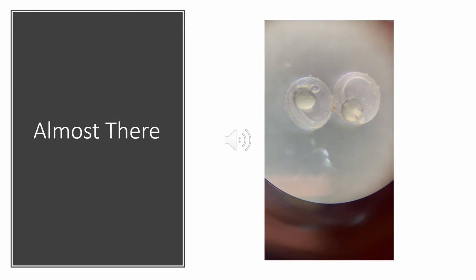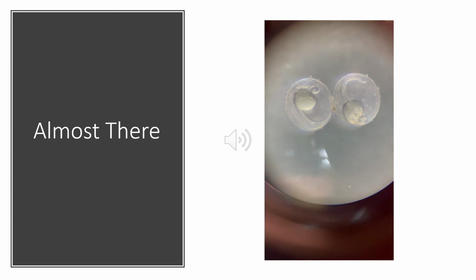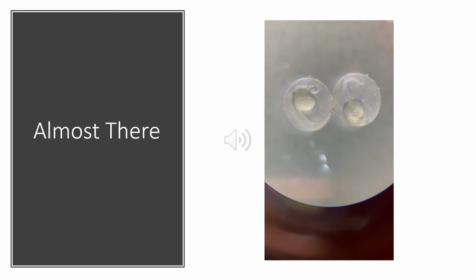Alrighty, as we can see, we are between the 24 and the 28 hour mark. You can see the eyes are starting to finally develop.